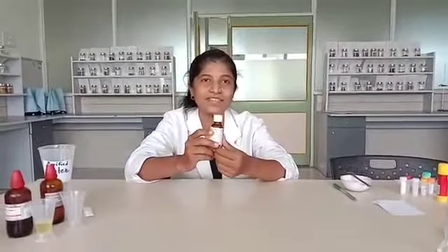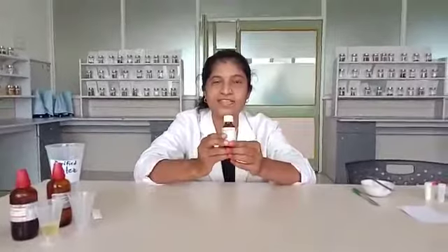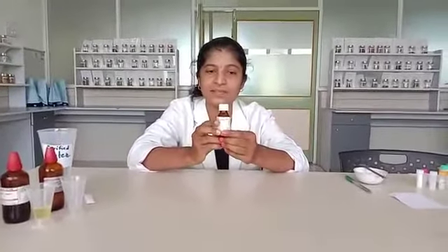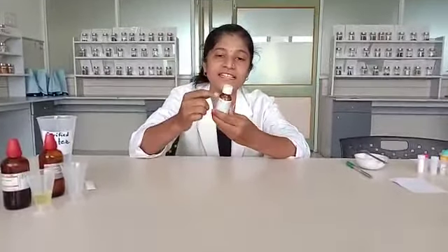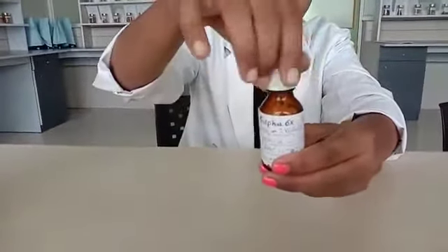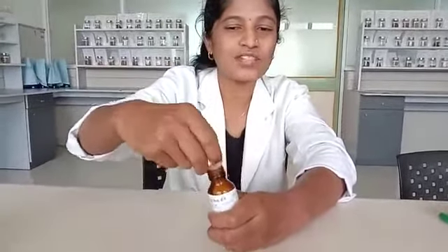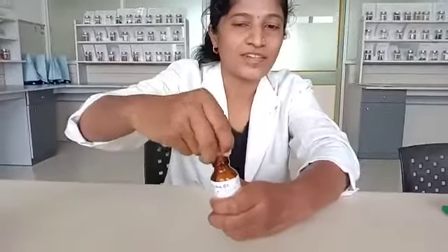The next method of dispensing medicines involves solid potency. The aim of this practical is dispensing of Sulphur 6x, which is in solid form. We are going to see how to dispense this solid potency.